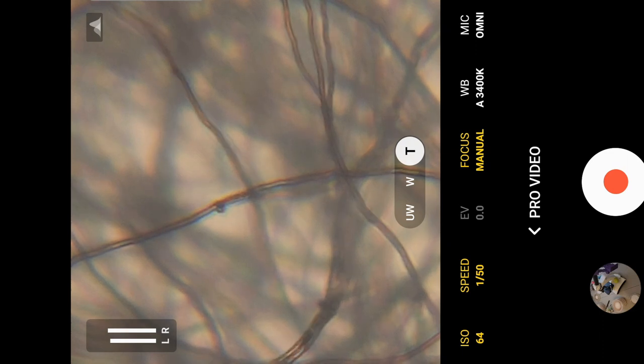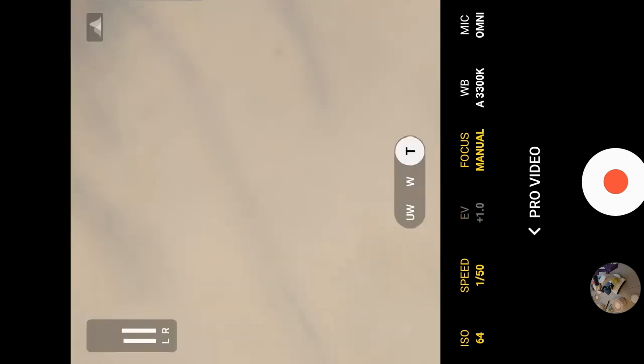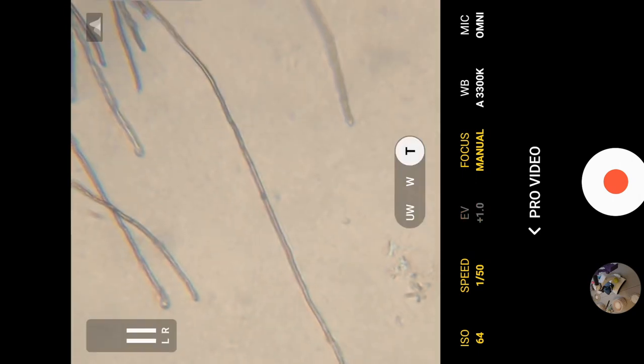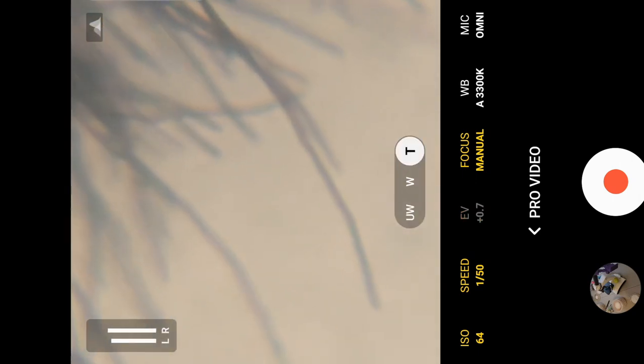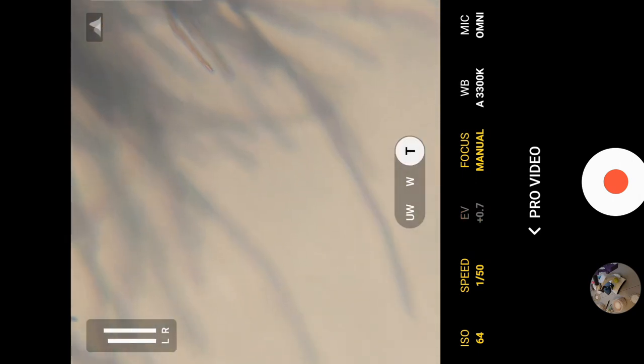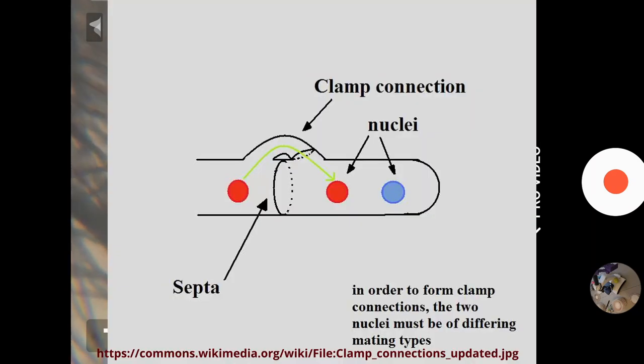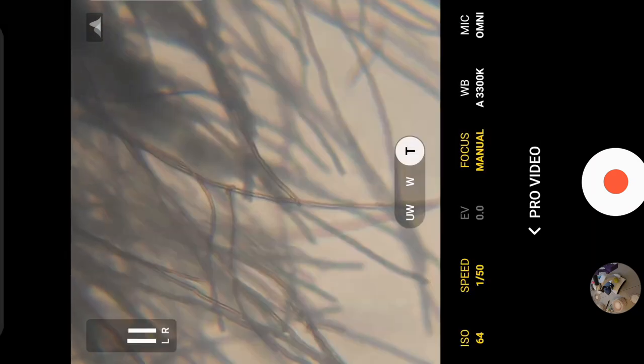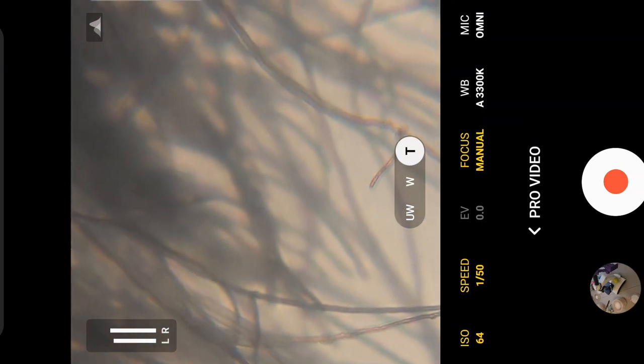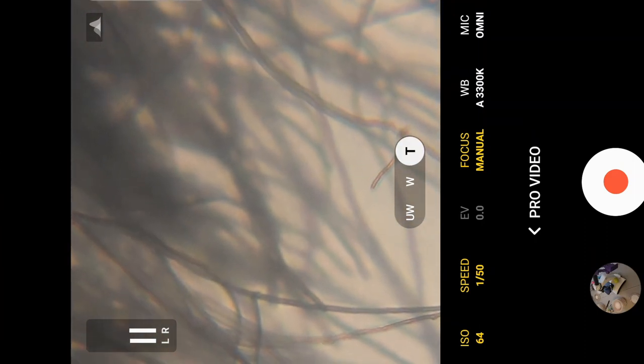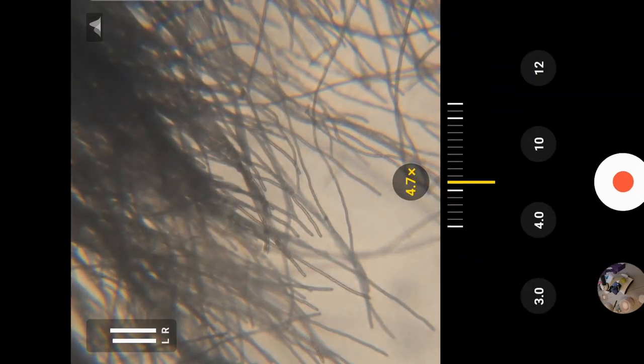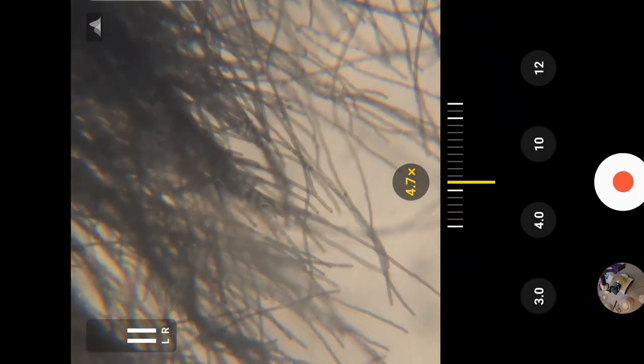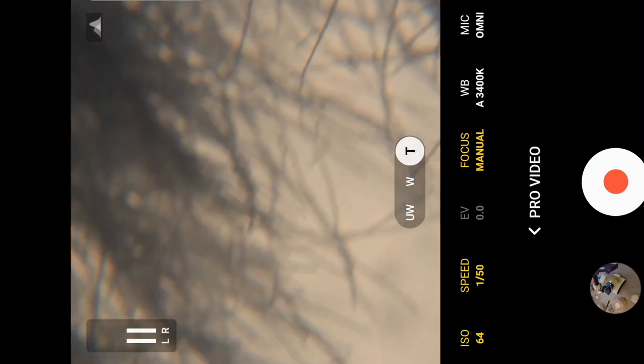Clamp connections are between hyphal cells, there will be a division. And between that division, there will be a clamp bridging the gap. And that signifies that the mycelium has mated. If you don't see that clamp, then the mycelium has not mated.